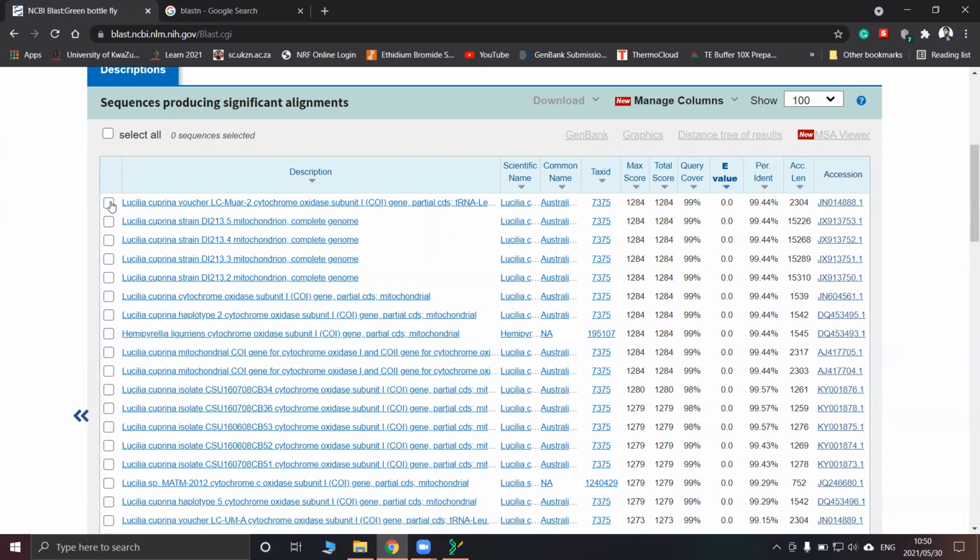As I said, the more stringent you set your assignments, the better. So a query coverage of greater than 99% would be the best, and in the name of good practice, let's stick with that. So we're going to select the top 10 hits that have a query coverage of greater than 99%, an e-value of 0, and a percentage ID of greater than 99%.